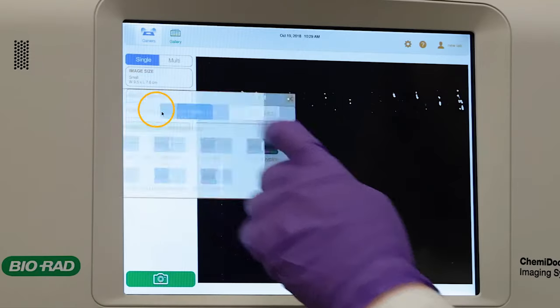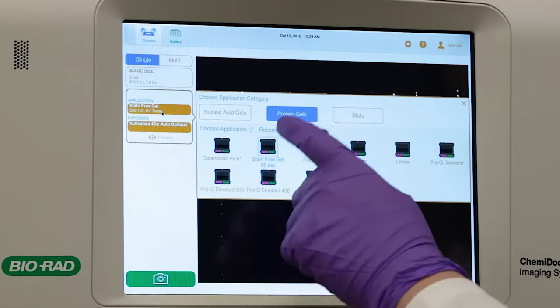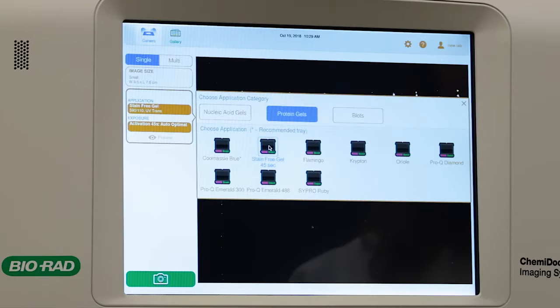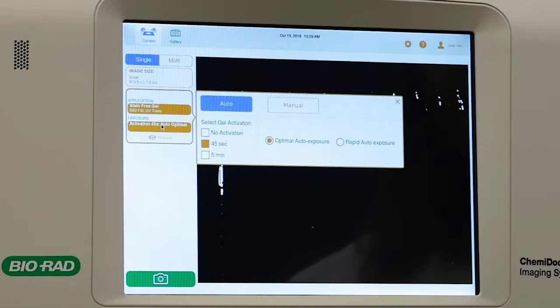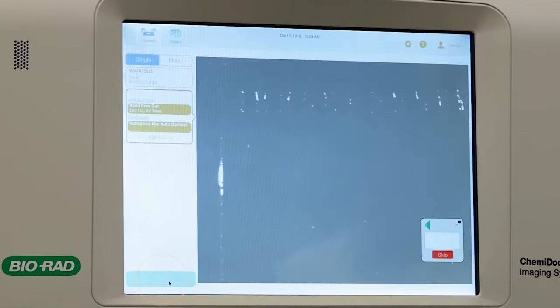Select stain-free gel as your application. Then, under exposure, select a gel activation time of 45 seconds for blotting or use 5 minutes for increased sensitivity, which can be helpful if the stain gel is the final product. Tap the camera button and capture the image.